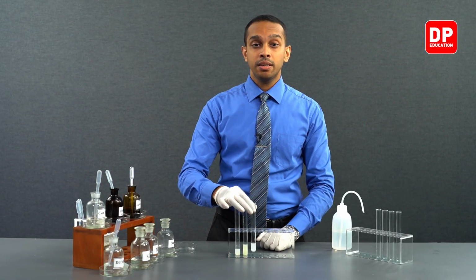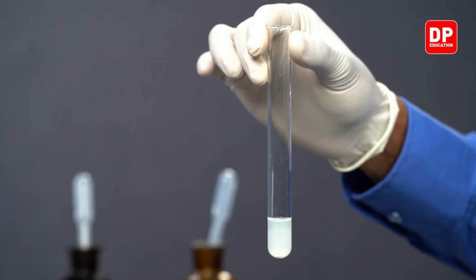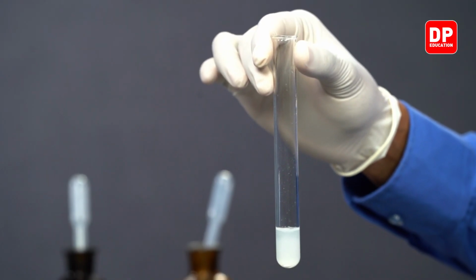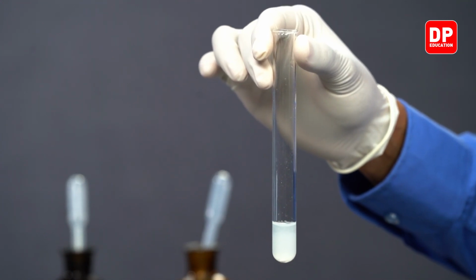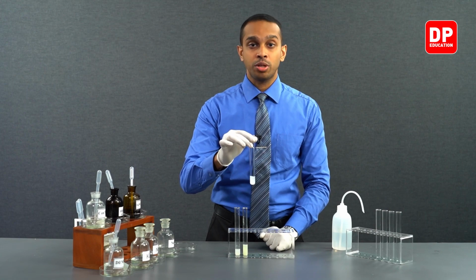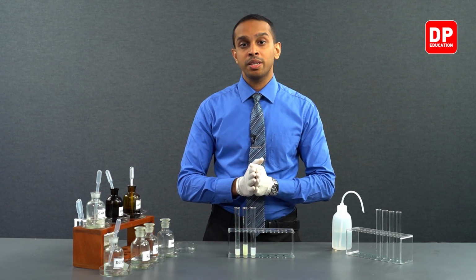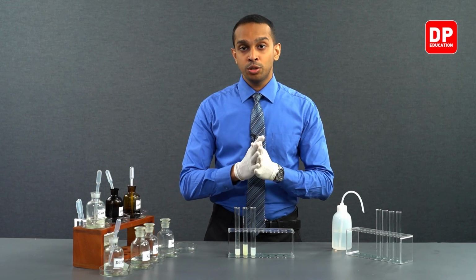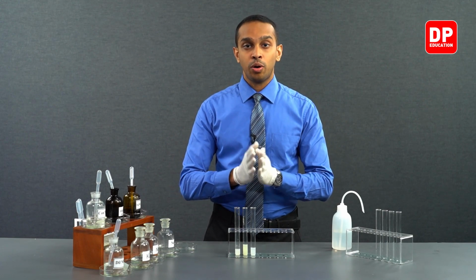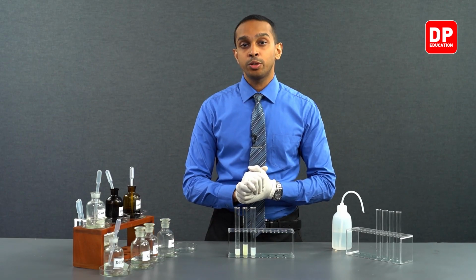And finally, we added concentrated ammonia into silver iodide precipitate. Again, no change took place upon addition of concentrated ammonia into silver iodide. So these are the observations that you will get when you are doing a confirmation test or identification test for iodide ions with the use of silver nitrate.